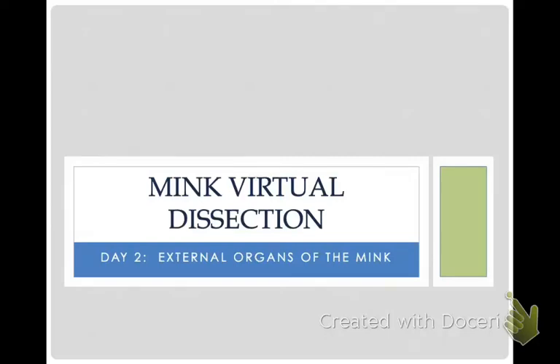Today is day 2 of our dissection. We'll be looking at the external organs of the mink, and we're also going to do a review of directional terms. I'll be showing you those directional terms on the mink. And so let's get started.